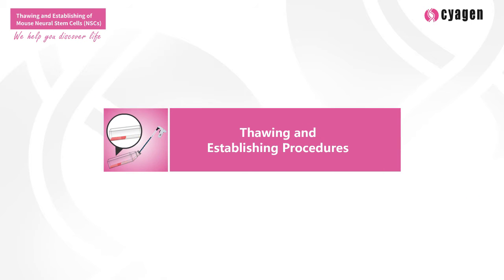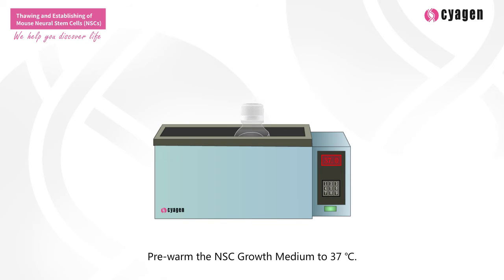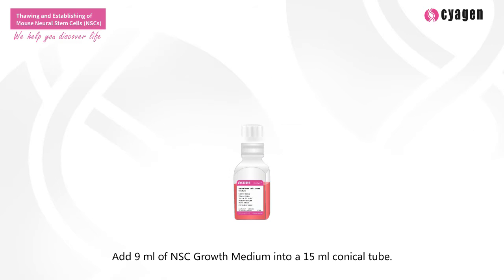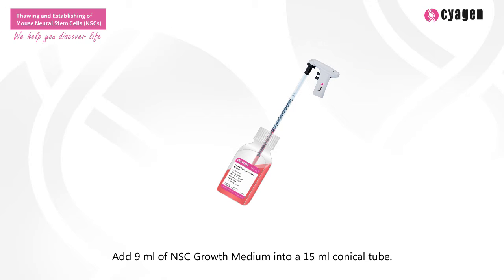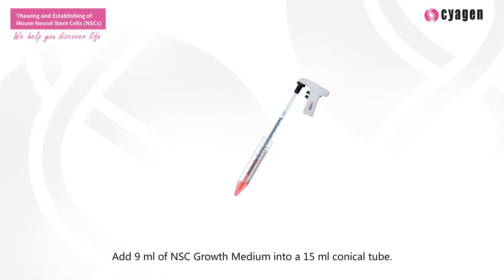Thawing and establishing procedures. Pre-warm the NSC growth medium to 37 degrees Celsius. Add 9 ml of NSC growth medium into a 15 ml conical tube.